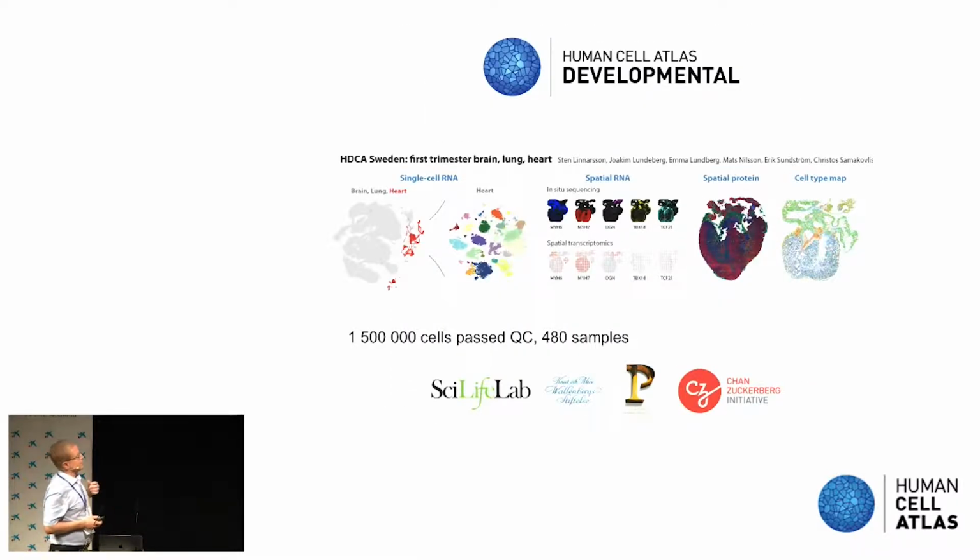Next application is in the Swedish part of the Human Developmental Cell Atlas project. Here we're targeting brain, lung, and heart, and we will also do some whole embryos with time. We're currently focusing on generating single-cell RNA sequencing data for this.